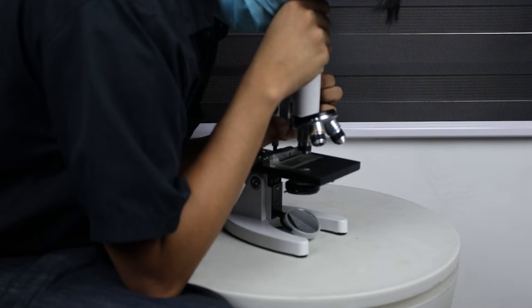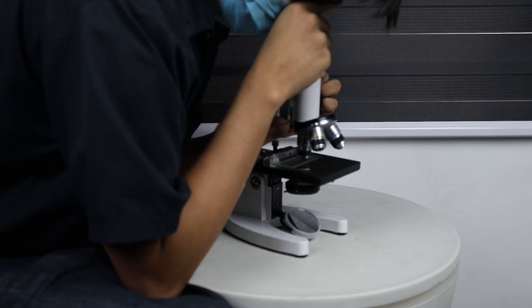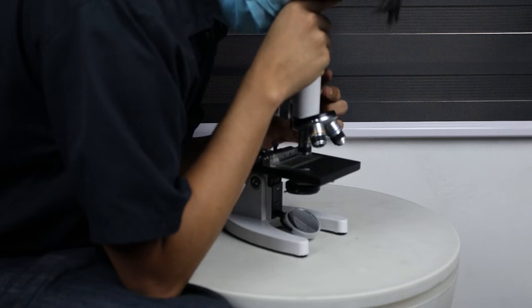Step 4: Adjust the coarse focusing knob to bring the slide into focus. Then lock the limit stop screw to avoid impact damage between the objective and slide. Adjust the fine focusing knob to get the image clear.